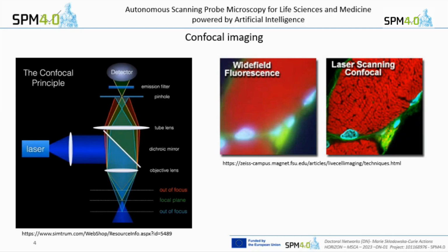Yes, by the way, I use a lot of information from this Zeiss Campus here, which is a very good resource if you want to read up on what kind of microscope. And usually you call these confocal microscopes CLSM. This is confocal laser scanning microscope.